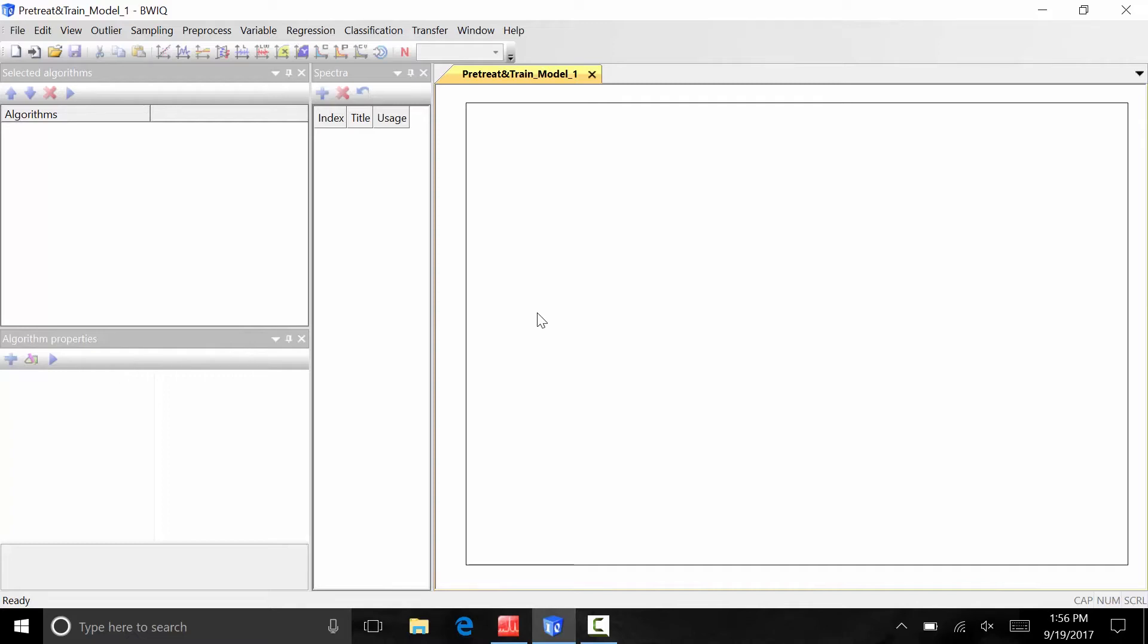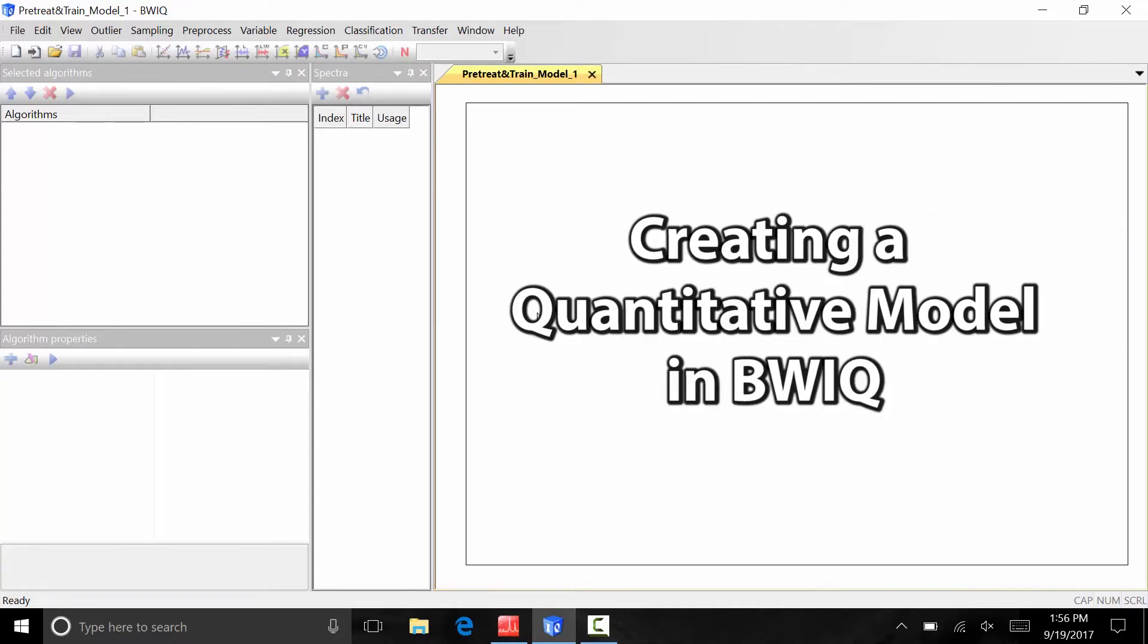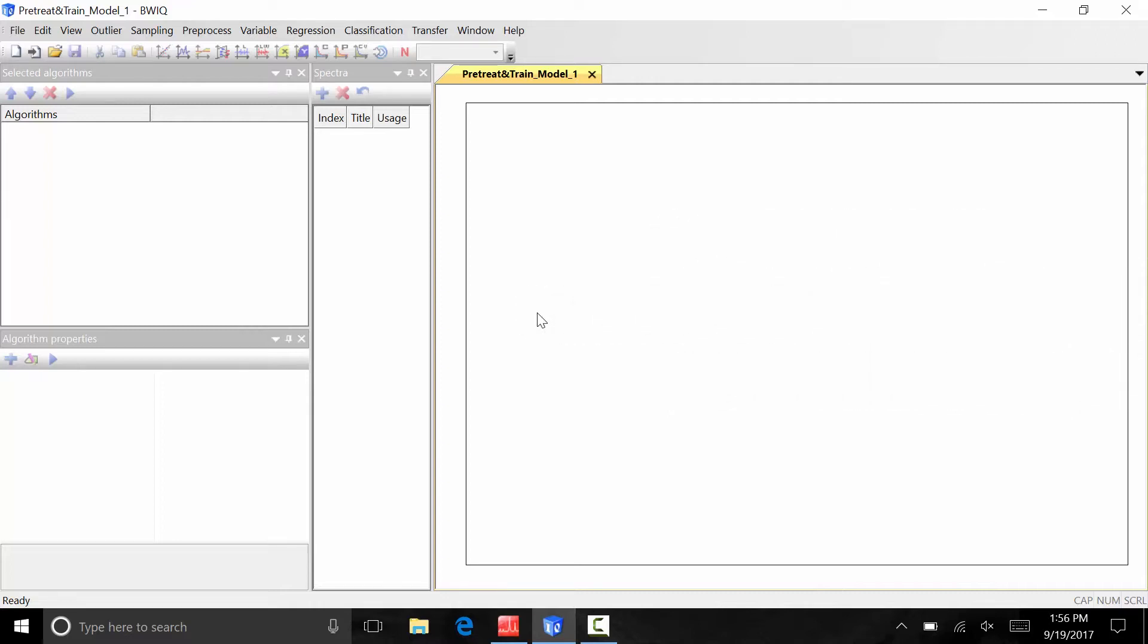BWIQ is B&W Tech's chemometric software designed for both on and offline quantitative and qualitative Raman and NIR spectroscopy measurements. Today we are going to use BWIQ software to create a quantitative model that will allow us to rapidly predict the amount of methanol in contaminated spirits using portable Raman spectroscopy.